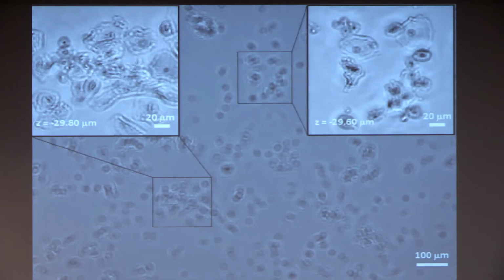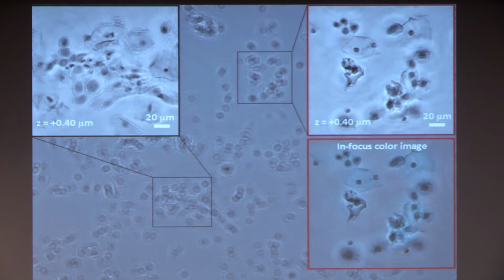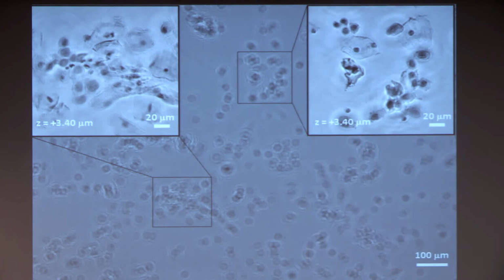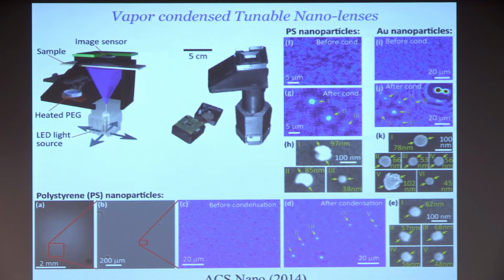Now you can actually capture images and create three-dimensional microscopic movies, as you can see here, focusing to different parts of the specimen, and a pathologist a few hundred kilometers away can actually look at these movies and go back and forth to different planes to make essentially diagnosis feasible, even if you don't have the presence of the expert.